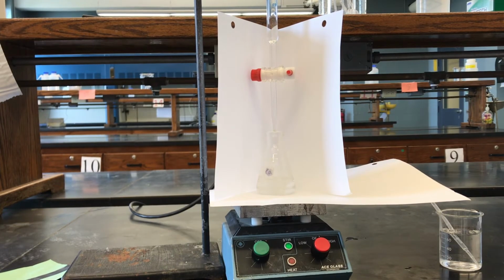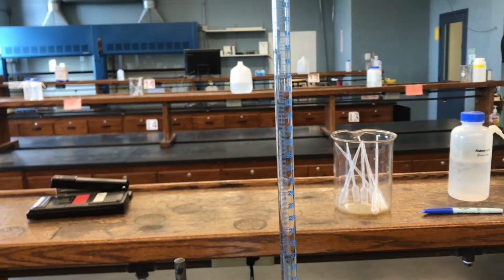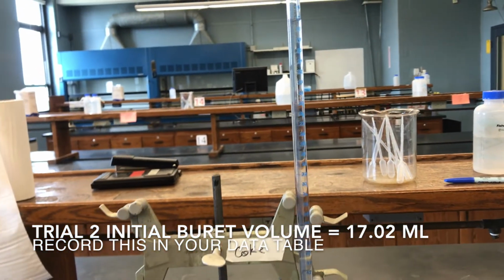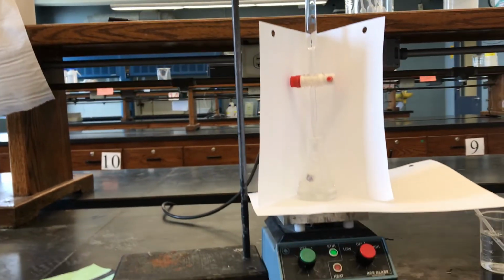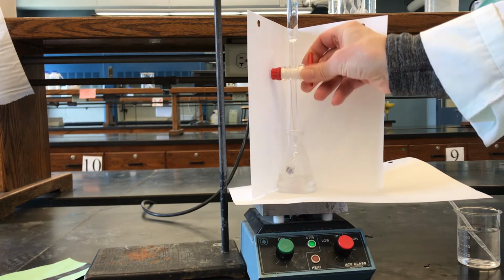Now I'm set up for the second titration. With the second titration, we're starting at an initial volume that's going to be the same as the final volume from the previous experiment. So just record that in your notebook as the initial volume. Whatever you had as the final volume from trial 1 is the initial volume for trial 2, and we'll just go ahead and do this until we get that nice pale pink again.